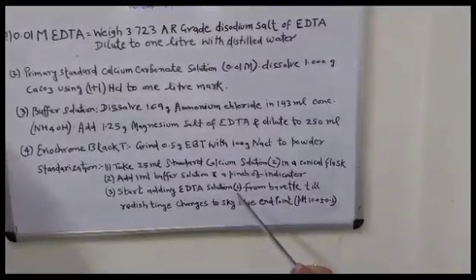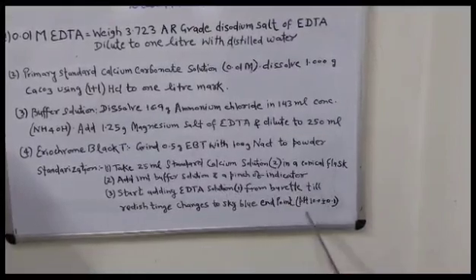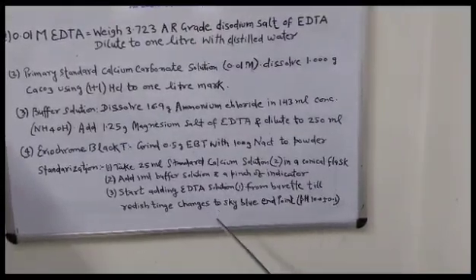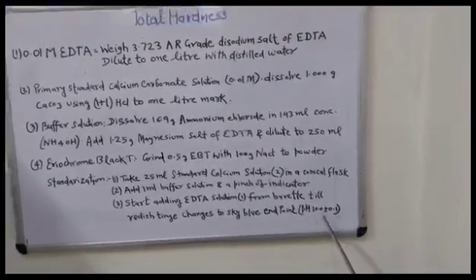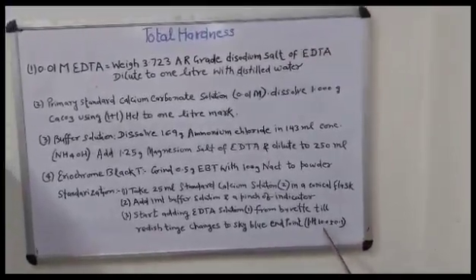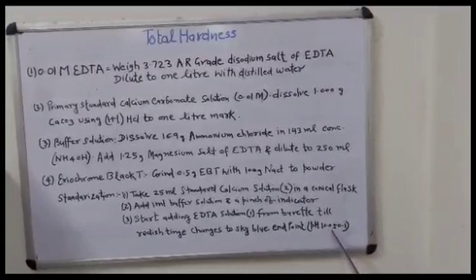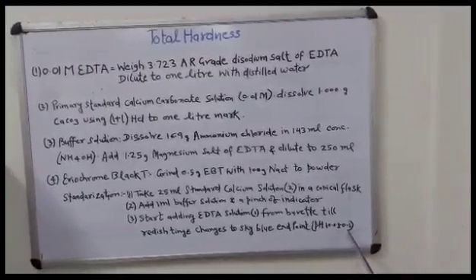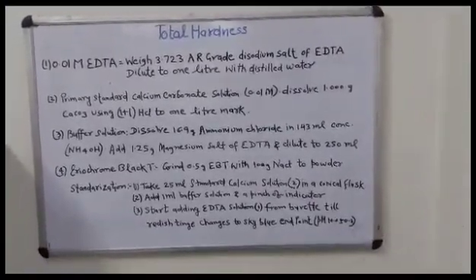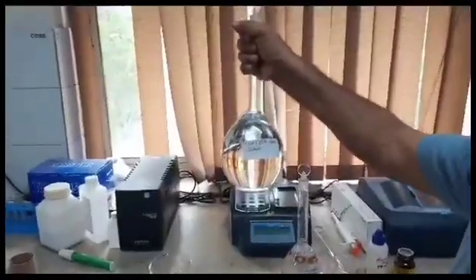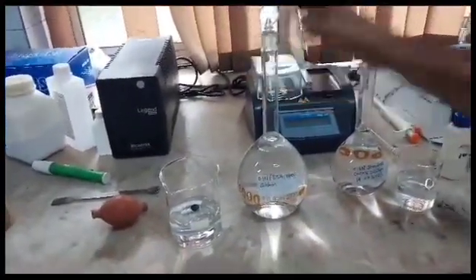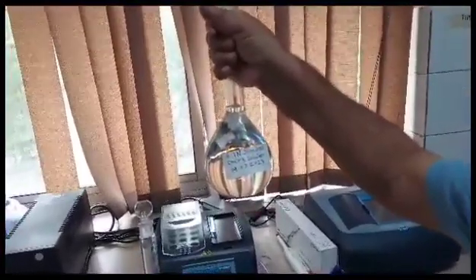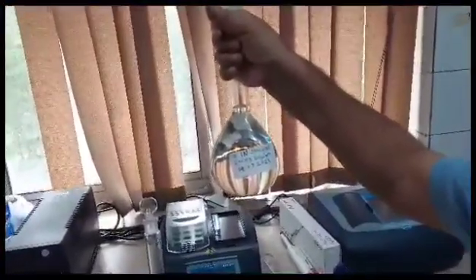Start adding EDTA solution from the burette until the red color of the solution changes to sky blue — that is the end point. The pH at the end point is 10 plus or minus 0.1. This is the approximately 0.01 M EDTA to be standardized, and this is the 0.01 M standard calcium solution.